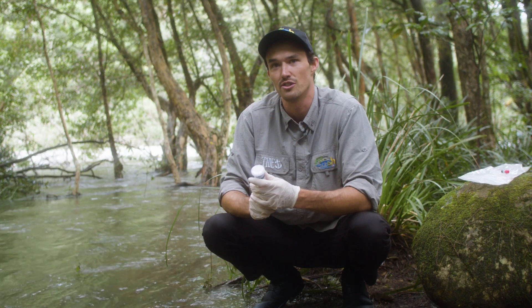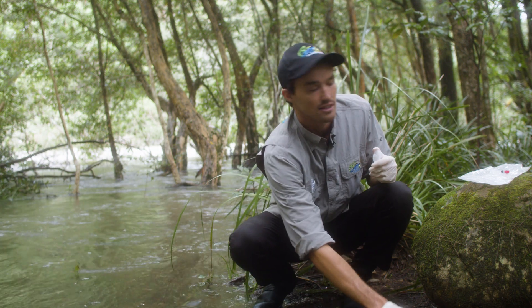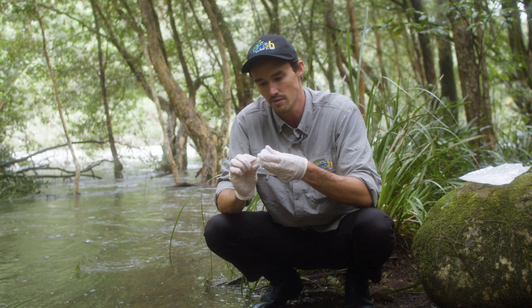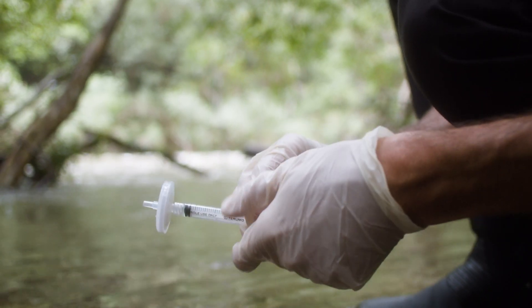Now all that's left is to push the preservative through so the DNA doesn't degrade before it gets to the laboratory. Just uncap the preservative, attach it to the filter, and push all of that into the filter.